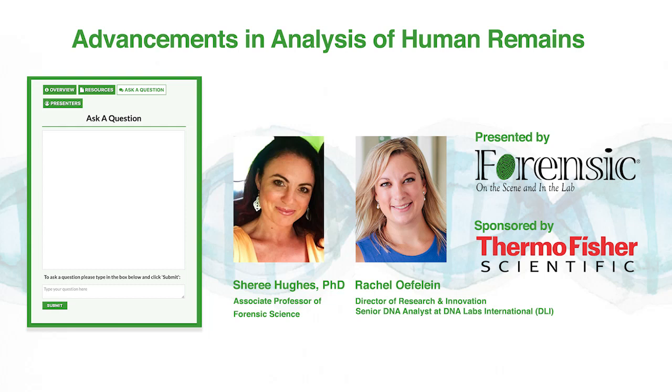Okay, gotcha. Well, while we're talking about sanding, once a bone sample is cleaned via sanding or another method, do you believe it is necessary to use bleach rather than a more gentle detergent wash before powdering or beginning the DNA extraction process? We don't use bleach directly on the bones at our laboratory. We do bleach all the tools that we use, and the surfaces within that hood have to be cleaned very, very carefully in between samples. But on the actual bone itself, we use ethanol and water washes. I'm always cautious of ever applying bleach to bones because I worry about it affecting the quality of the sample. I know a lot of laboratories do, but ours, after sanding, I don't see any need of doing any washes outside of ethanol and water.